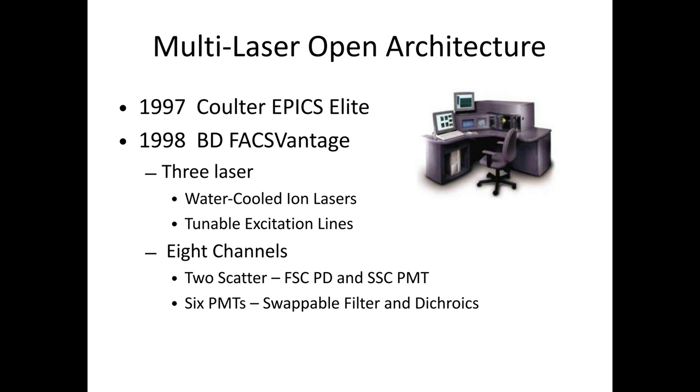We were all using the CellQuest software, but this was back in what I want to call the LP record days. We were still using analog systems. Just like an LP record, where you hear the little hisses and scratches, there was built-in noise to the system in the log amplifiers that gave a certain visualization effect to data, especially during compensation.